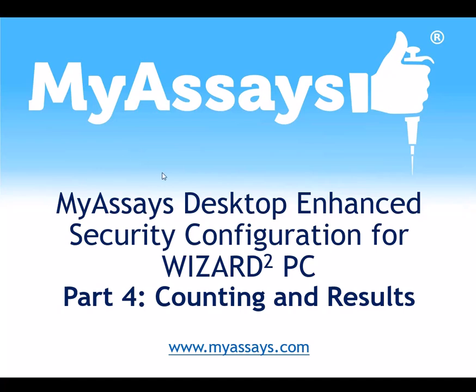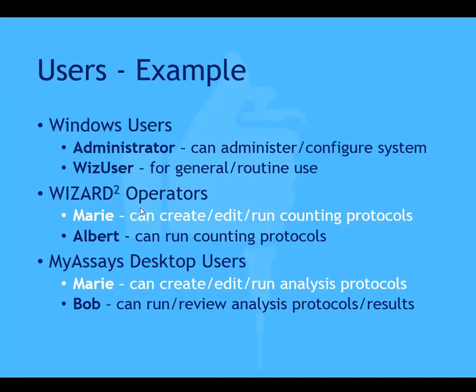In this final video part in this series, I will show how to work with integrated counting and data analysis protocols. I'll show how to access results and how the integration works for users with different perspectives and authorizations. So in part 3, we use Marie's account to configure a counting protocol integrated with a data analysis protocol. Recall that Marie has permissions to create and edit and run counting protocols, and also to create and edit and run data analysis protocols. So let's continue from there and show the integration in action for Marie.